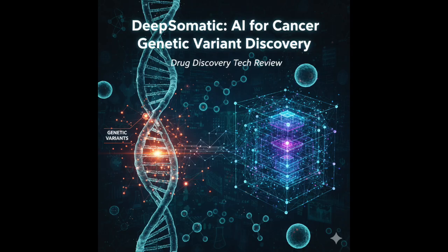Why use all 3? Isn't that expensive and complex? It is, but it was crucial for validation. Every sequencing technology has its own biases, its own characteristic error patterns. A variant called only by Illumina might be an Illumina-specific artifact. A variant only seen by ONT might be an ONT error. So if a potential variant shows up independently on 2 or 3 different technologies... And you can be much, much more confident that it's a real biological variant, not just a technological glitch.